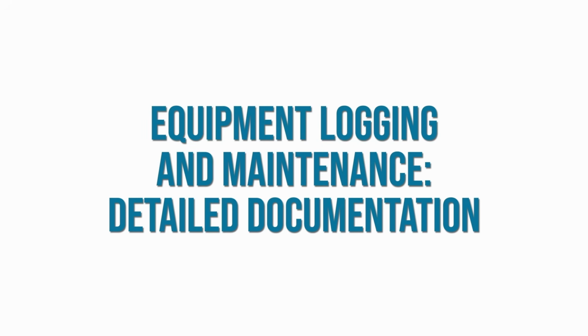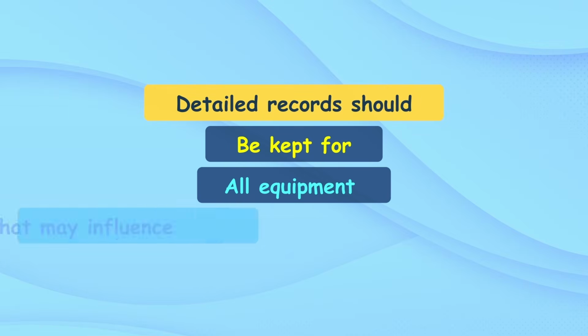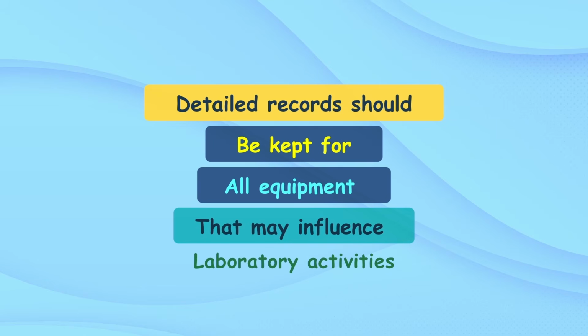Equipment logging and maintenance. Detailed documentation. Finally, detailed records should be kept for all equipment that may influence laboratory activities.